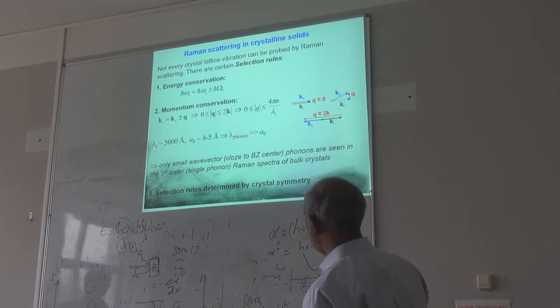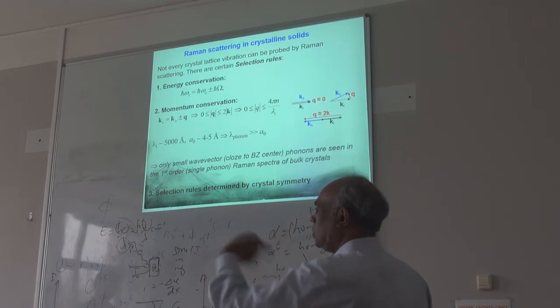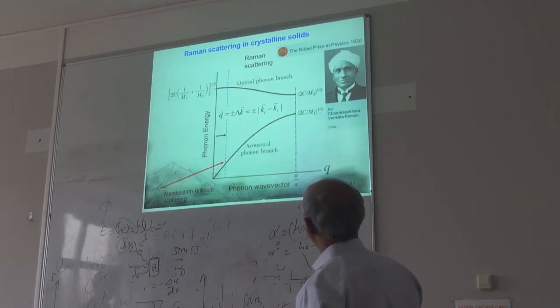So this explains how the phonons are created. So initial one, this is the scattered one. So plus means you create a phonon, minus means we call it annihilate the phonon. Right? So depending on that you can get different lambda. I don't know whether you're familiar with this one.